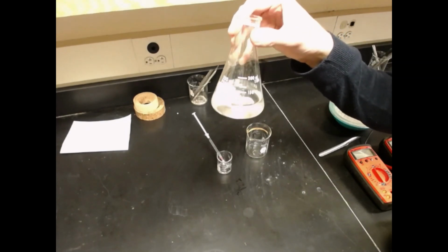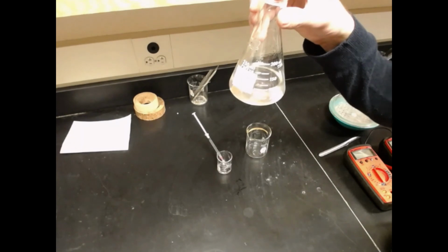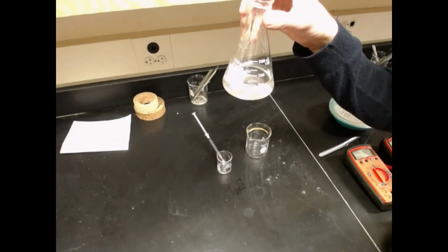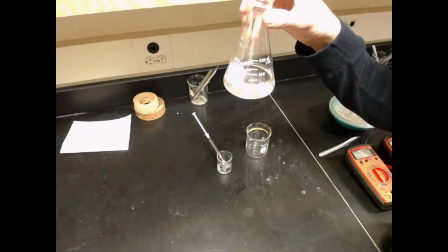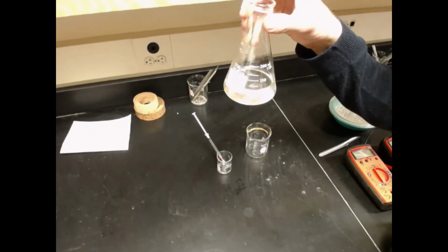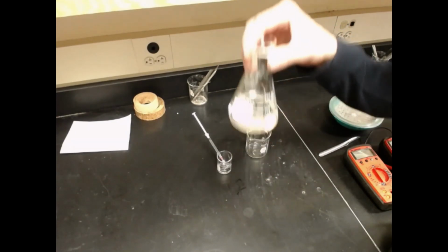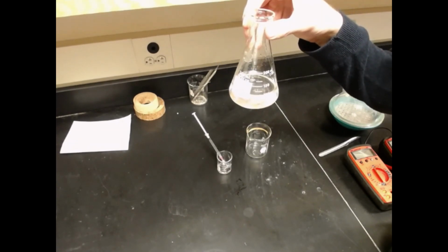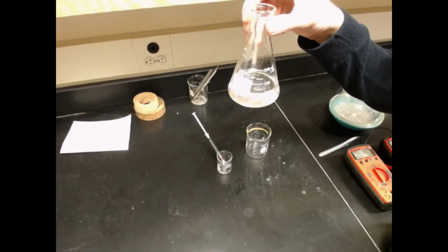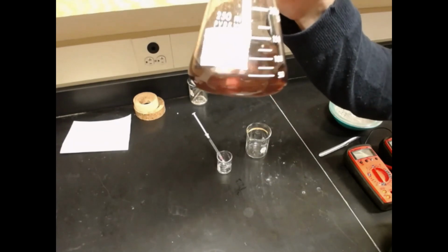This one isn't exciting until the reaction is done and we see the color change. I did test this beforehand, so I know it will work. When I came in, the solutions were not fresh, so I had to make them up fresh again, and then the reaction worked. It didn't work when they were not fresh. All right, still no color change, still looking clear. All right, and now hopefully you can see it turn dark.